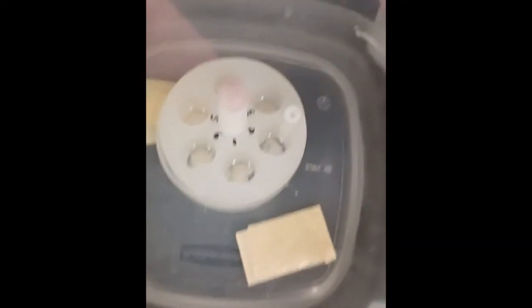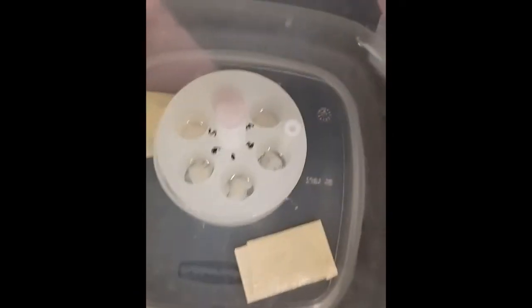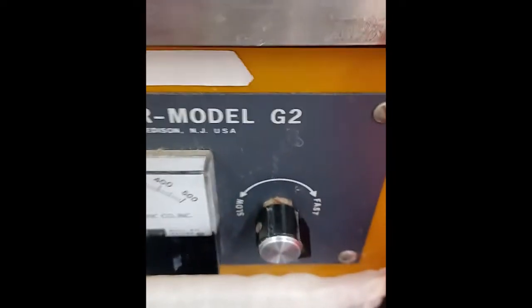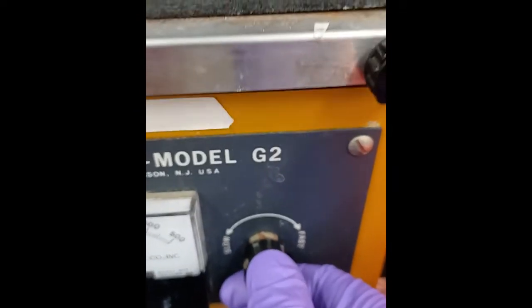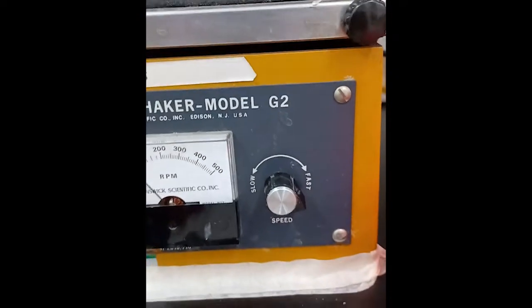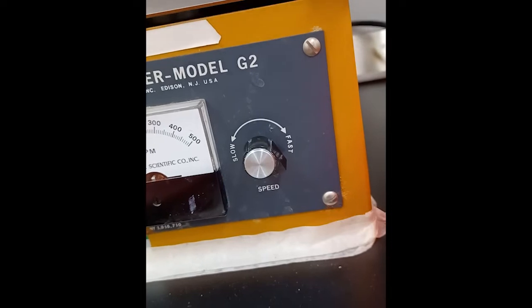If the shaker is set too high a speed, the solution may actually spill out of the basin, or the sections may get stuck along the edges and become damaged. The shaker does make a loud clunking sound like you hear here. Don't mind that too much.